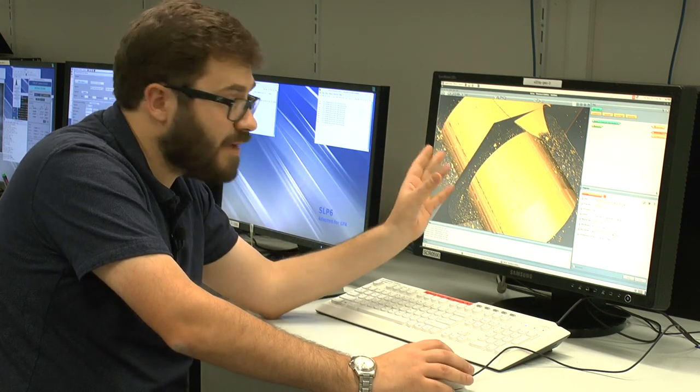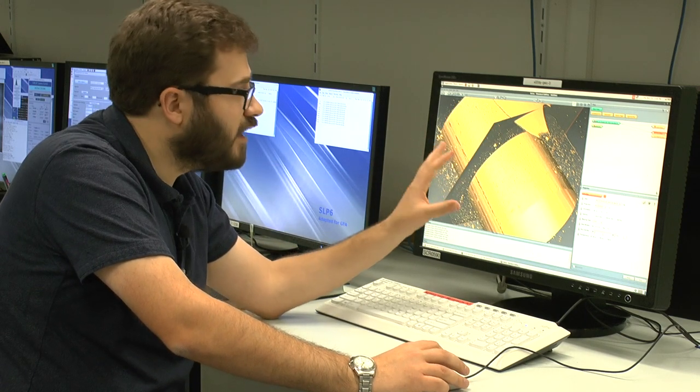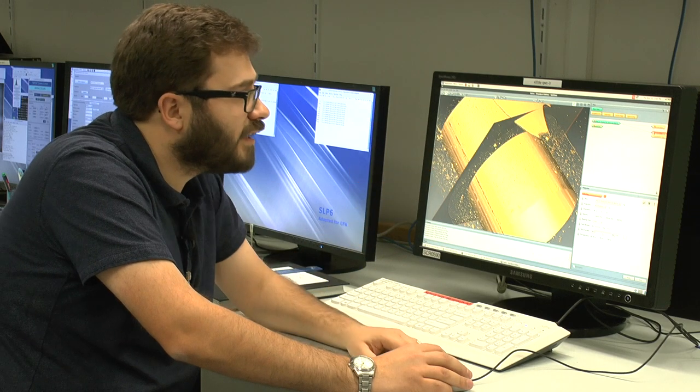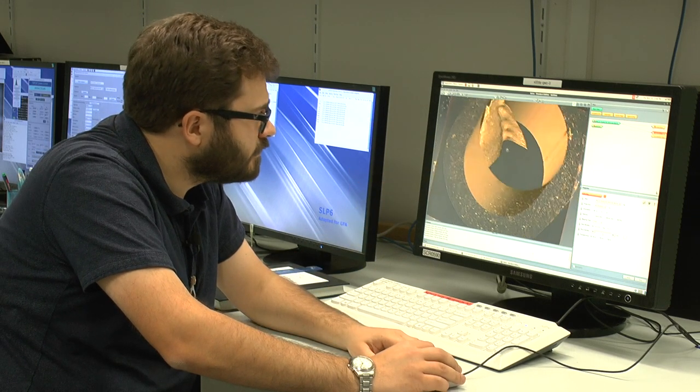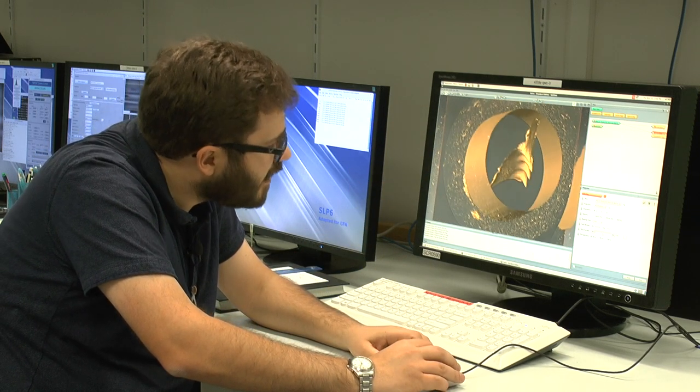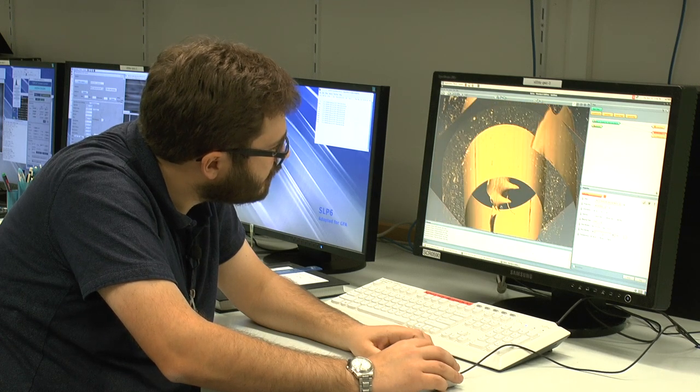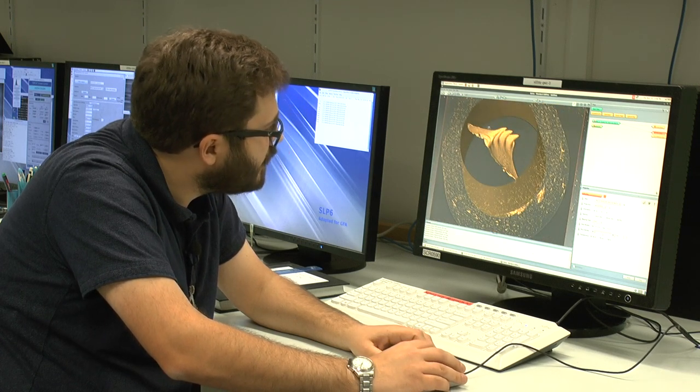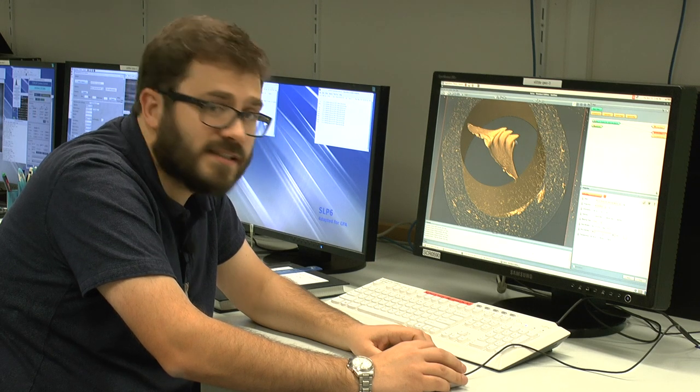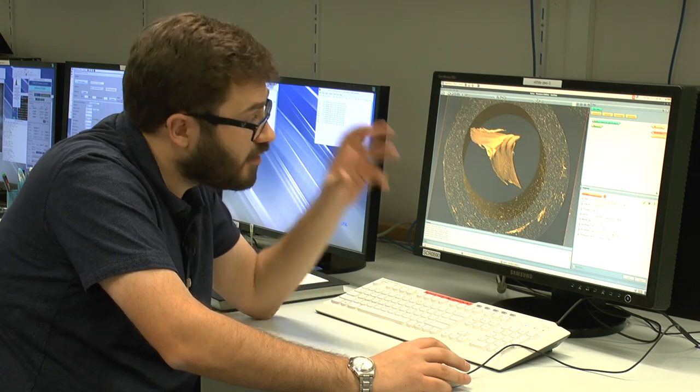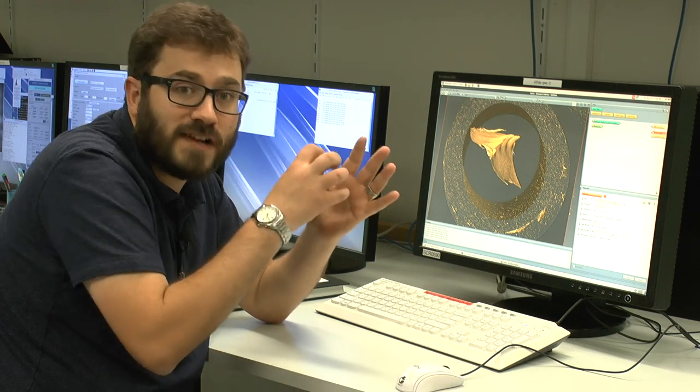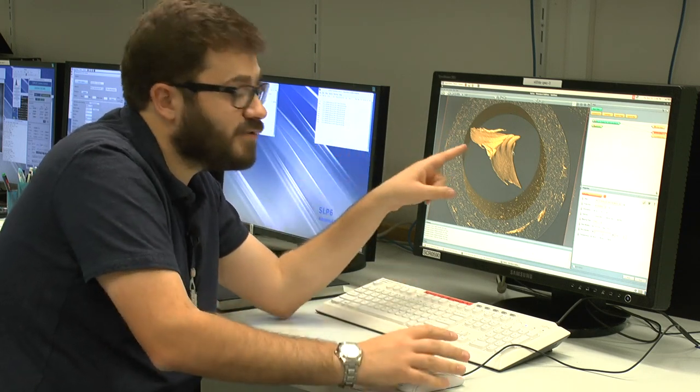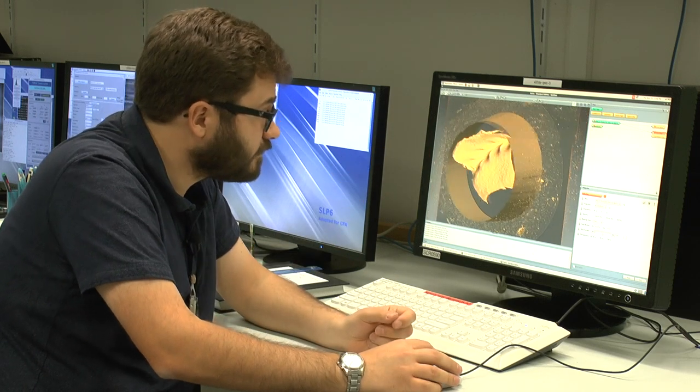So with a bit more time and effort, we could manually remove all of that and get a nice model out in the end. But you can see inside, here's the tooth. I'll get it looking nice. With these little processes that the lamprey uses for grabbing onto its prey that it rasps on the side of. And then it uses these to rasp away at the flesh.